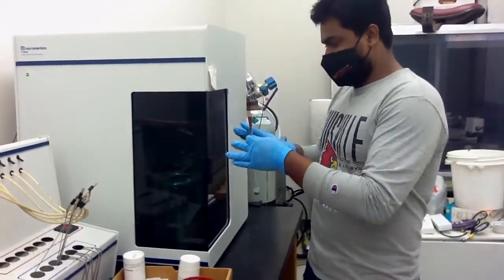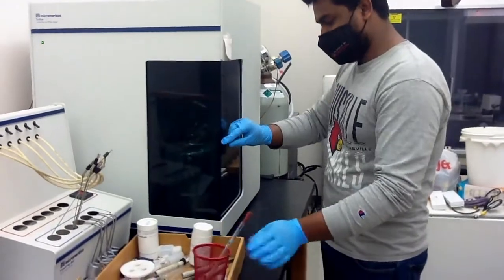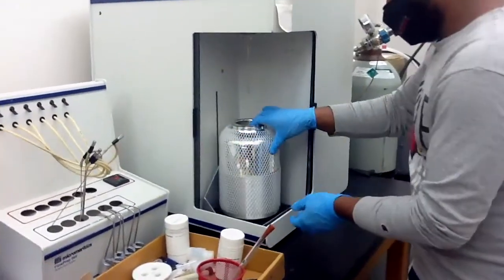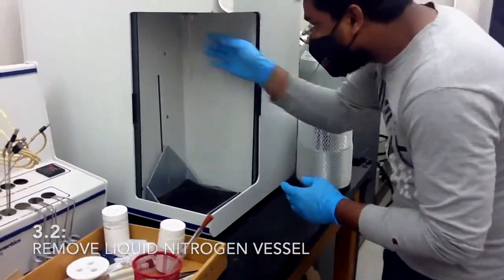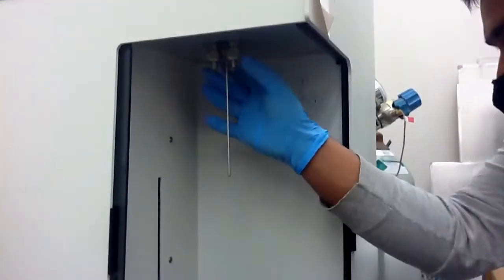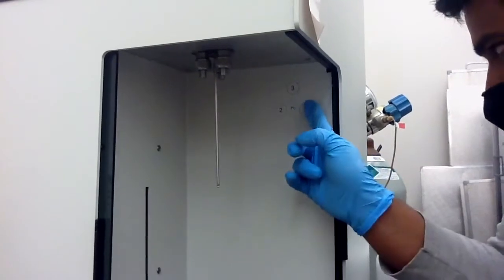I will now put my sample inside of this machine. At first what you need to do is just open it and remove this box. You can see there are three ports here.